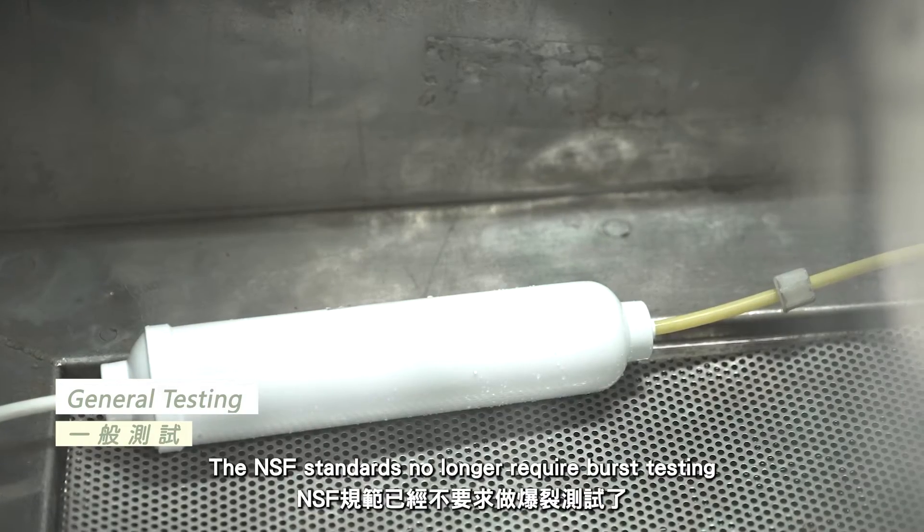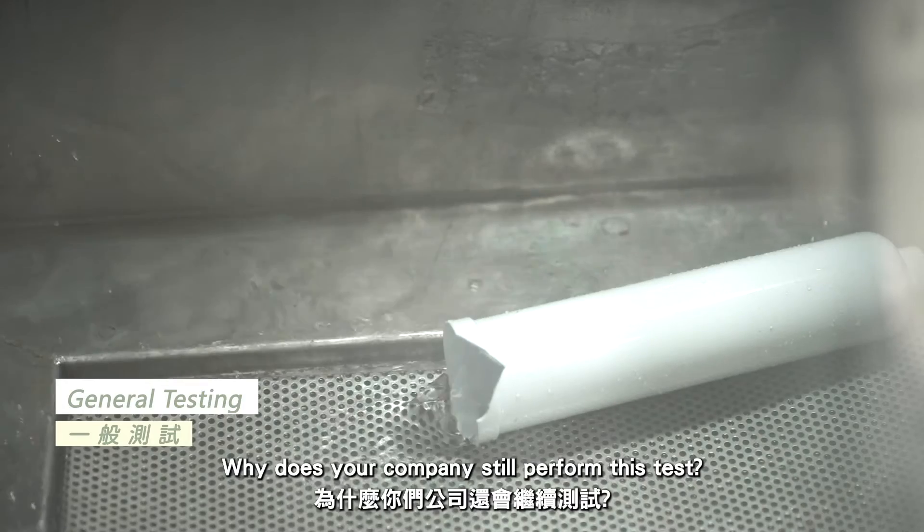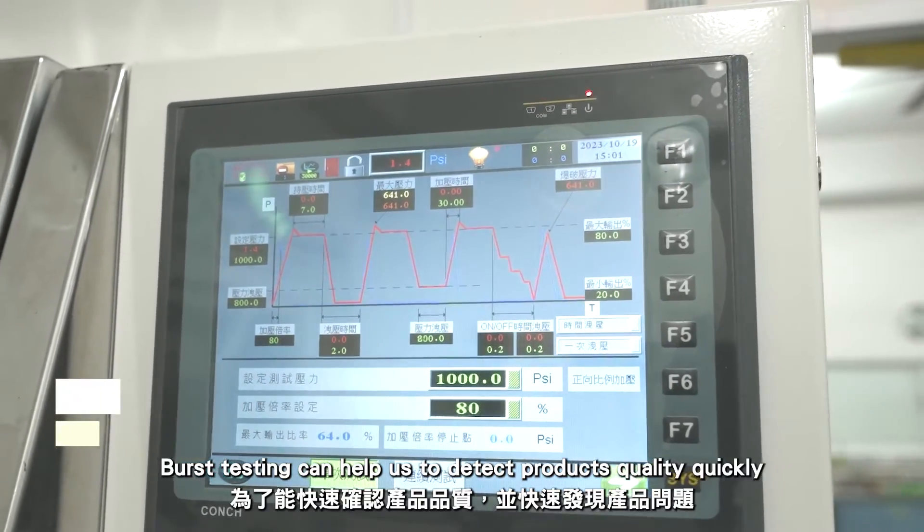The NSF no longer requires burst testing. Why does your company still perform this test? Burst testing can help us to detect product quality quickly.